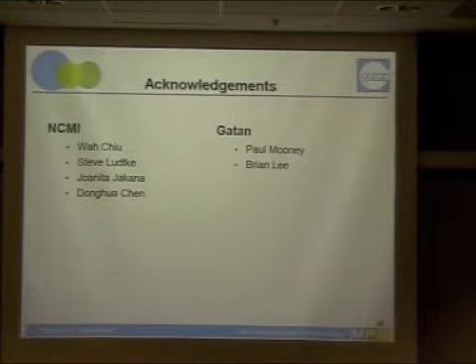How much better? Well, Paul is starting to quote specs on these in terms of DQE at certain fractions of Nyquist, and I will let you talk to him directly to get exactly what those numbers and differences are. But you'll start to see those numbers when you're looking at a camera spec. You'll see DQE at half Nyquist or some fraction of Nyquist frequency.